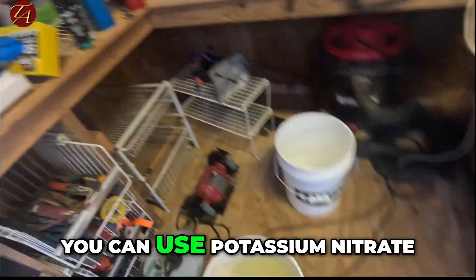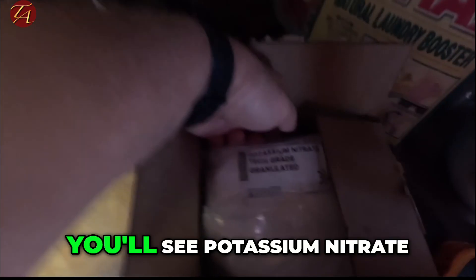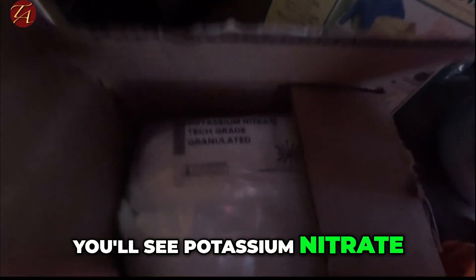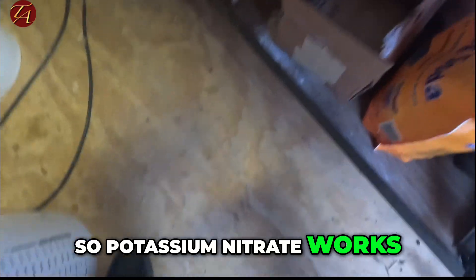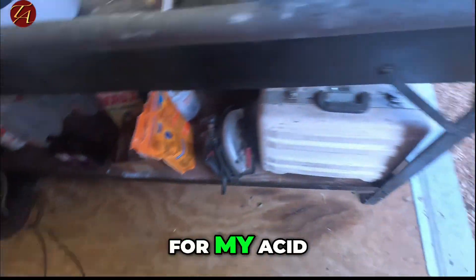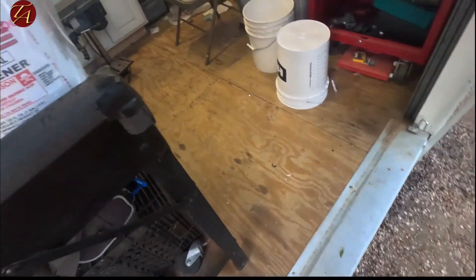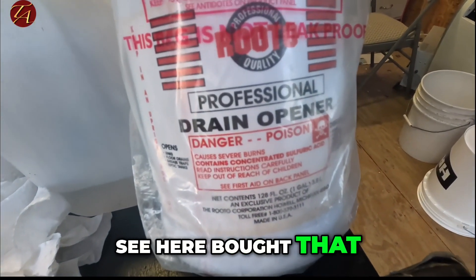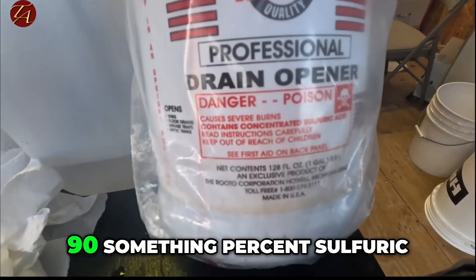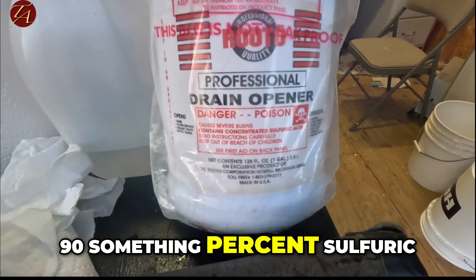You can use potassium nitrate — I have some in this box, you can see it right here, and potassium nitrate works. For my acid, I'm using professional drain opener, which I bought at Ace Hardware — it's 90-something percent sulfuric acid. So you'll need some of that.